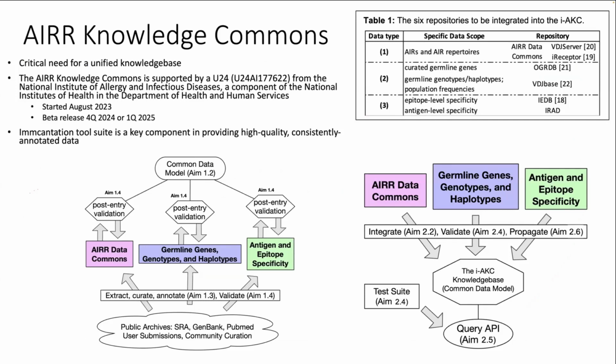We said, well, hey, this is a critical need to bring together and unify these resources so that users have one place to go, where they can do queries across all of that and get the data that's already in a high quality, well curated format.